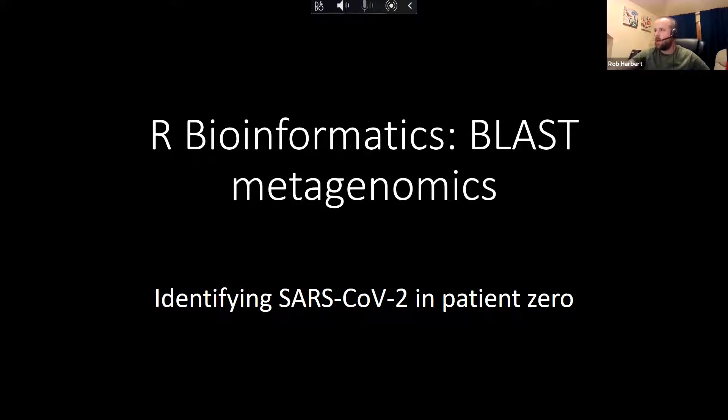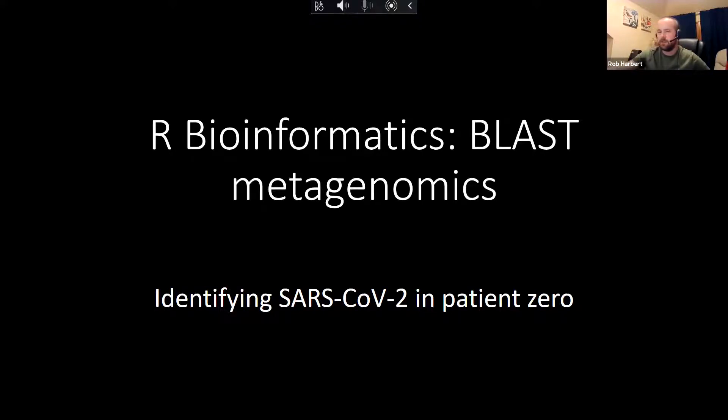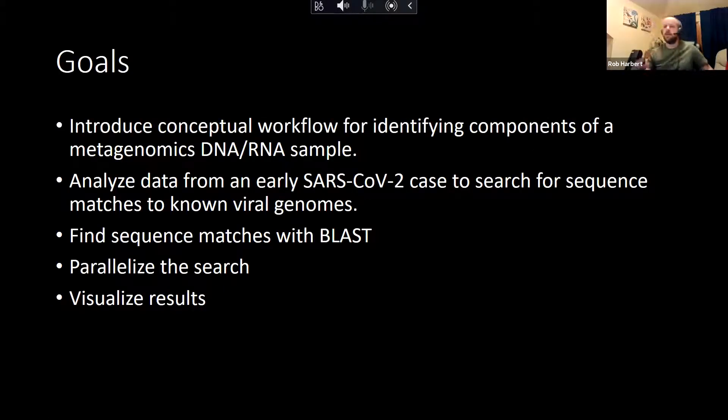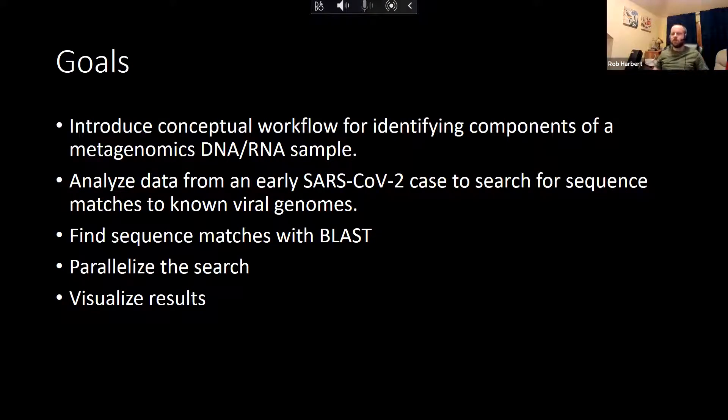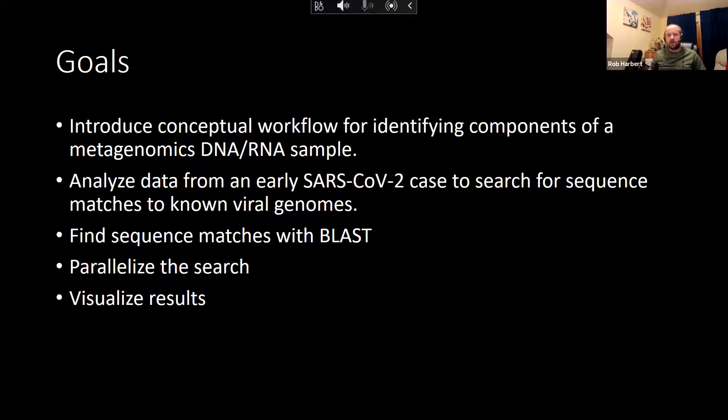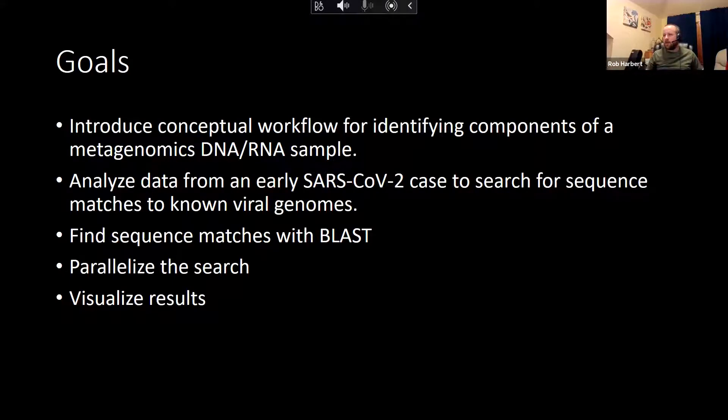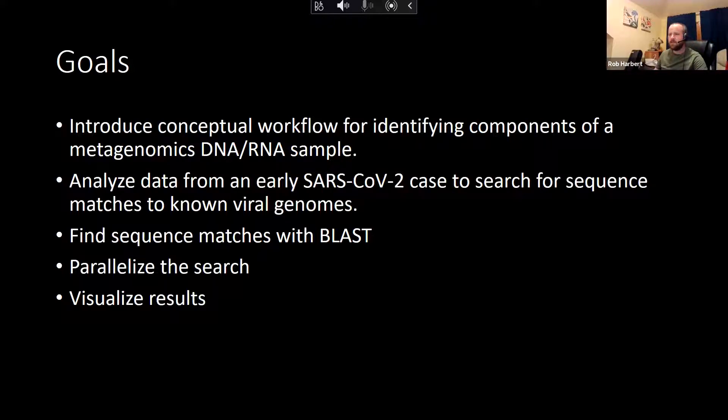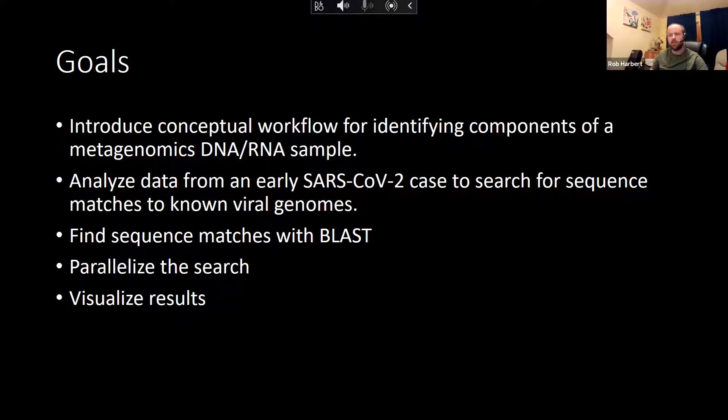Hi everyone, and welcome back. We're going to continue with our bioinformatics video series with a workshop here on BLAST metagenomics. We're going to introduce this conceptual workflow that's going to be similar to any metagenomic classification program. So we're going to take raw data from an early COVID patient and we're going to use BLAST to find sequence matches to a database of known viral genomes.